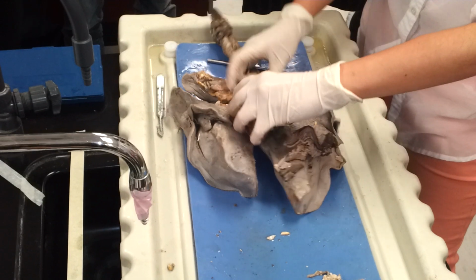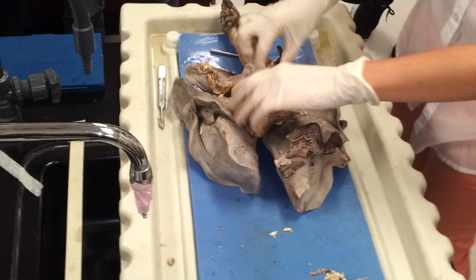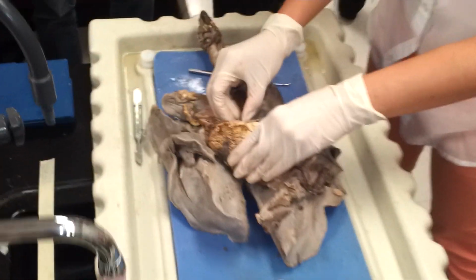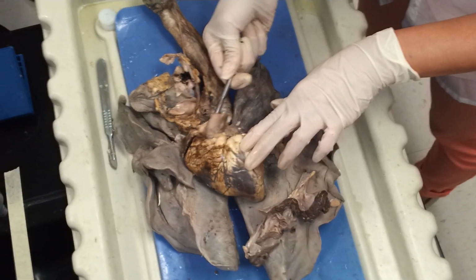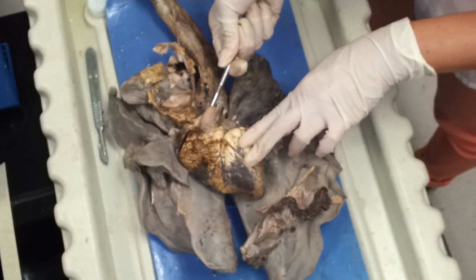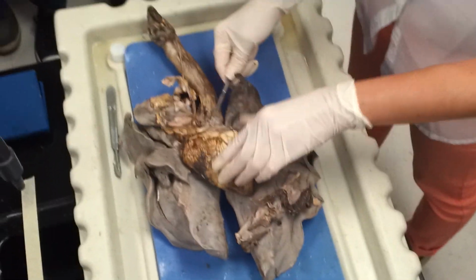And the heart will connect to somewhere there. Don't worry about it. But then we cut it off right here. And this is really nice because we can see this pulmonary trunk. Do you see that? There's a pulmonary trunk. Right? So, again, this is the anterior of the heart. And then anterior of the lungs, too.